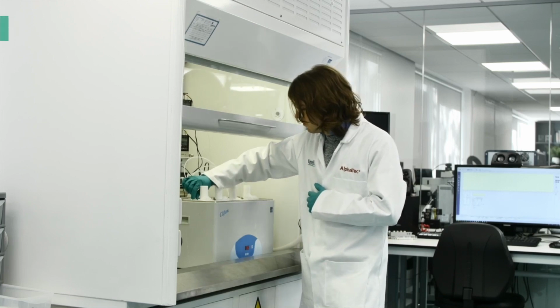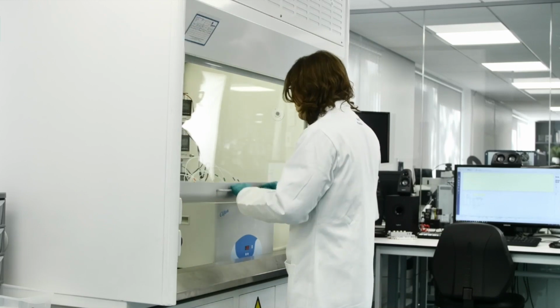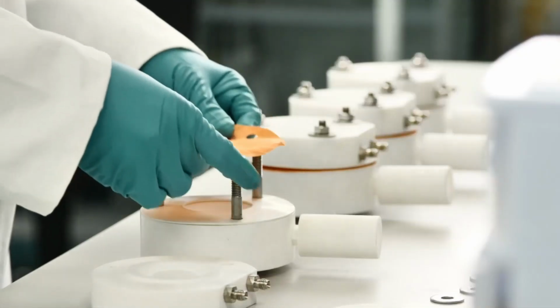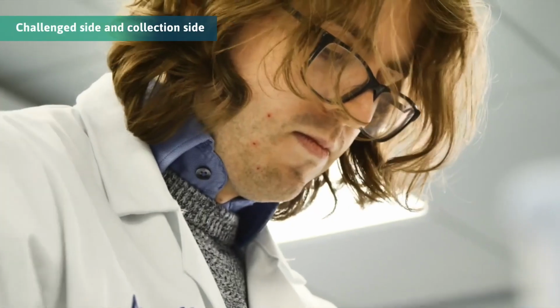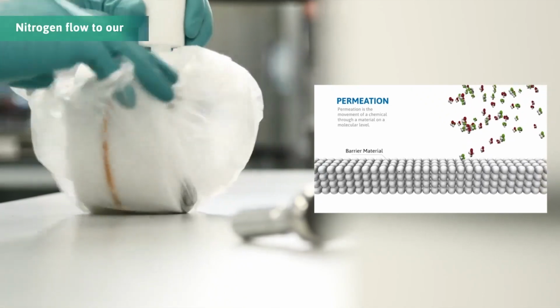So here we have the gas chromatograph and mass spectrometer, also known as GCMS. Here we're using a similar methodology seen in the GC-FID, where we use the same permeation cell setup to detect chemicals moving through a barrier. Here we have two sides to our cell, the challenge side and collection side. The chemical that is permeated is then carried by a nitrogen flow to our GCMS.